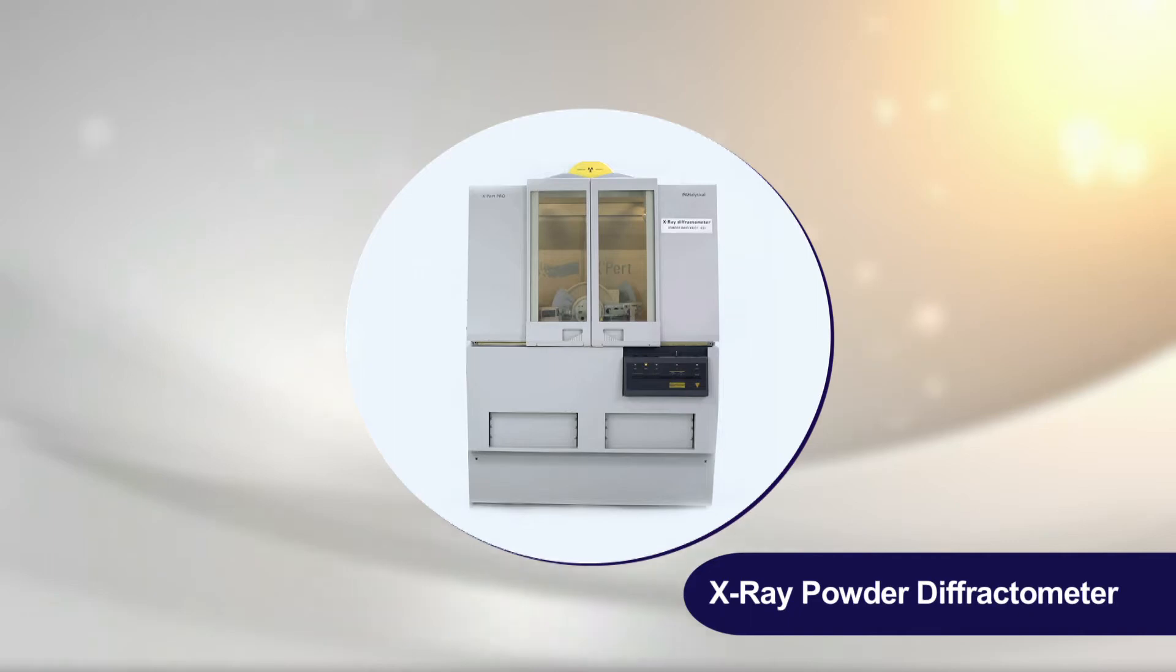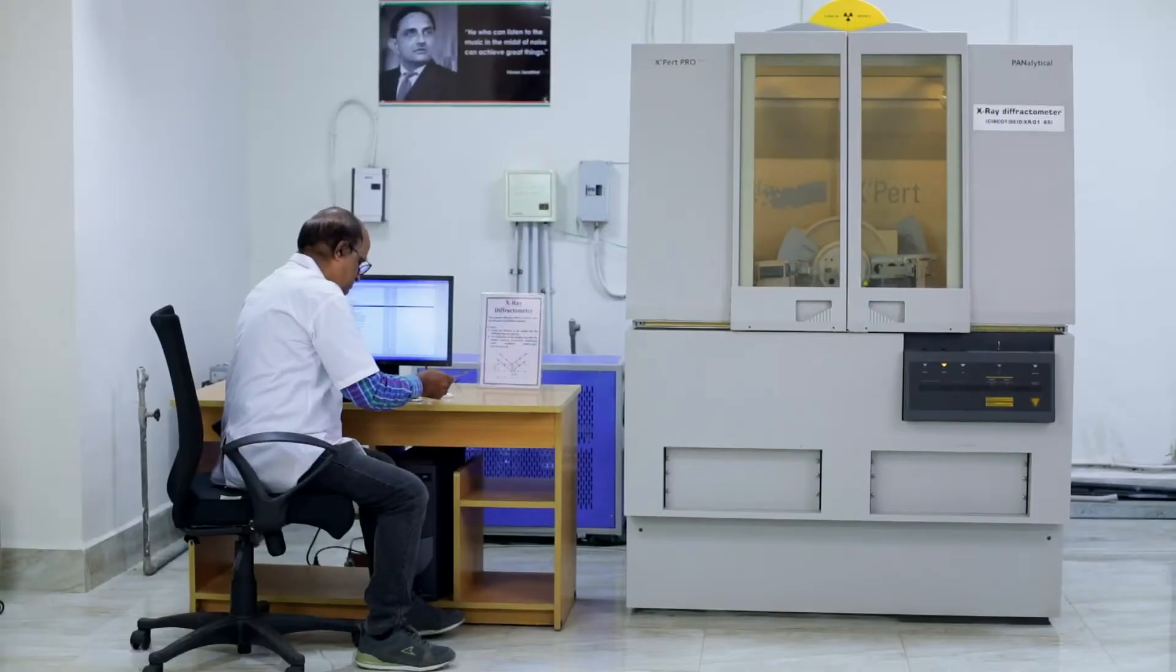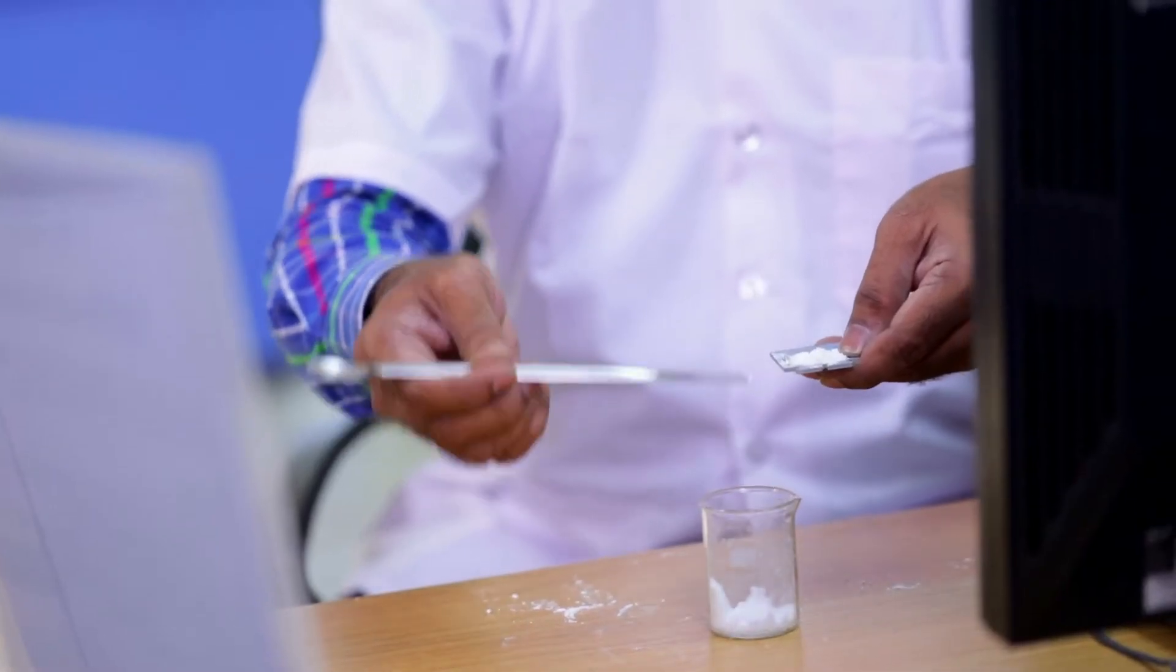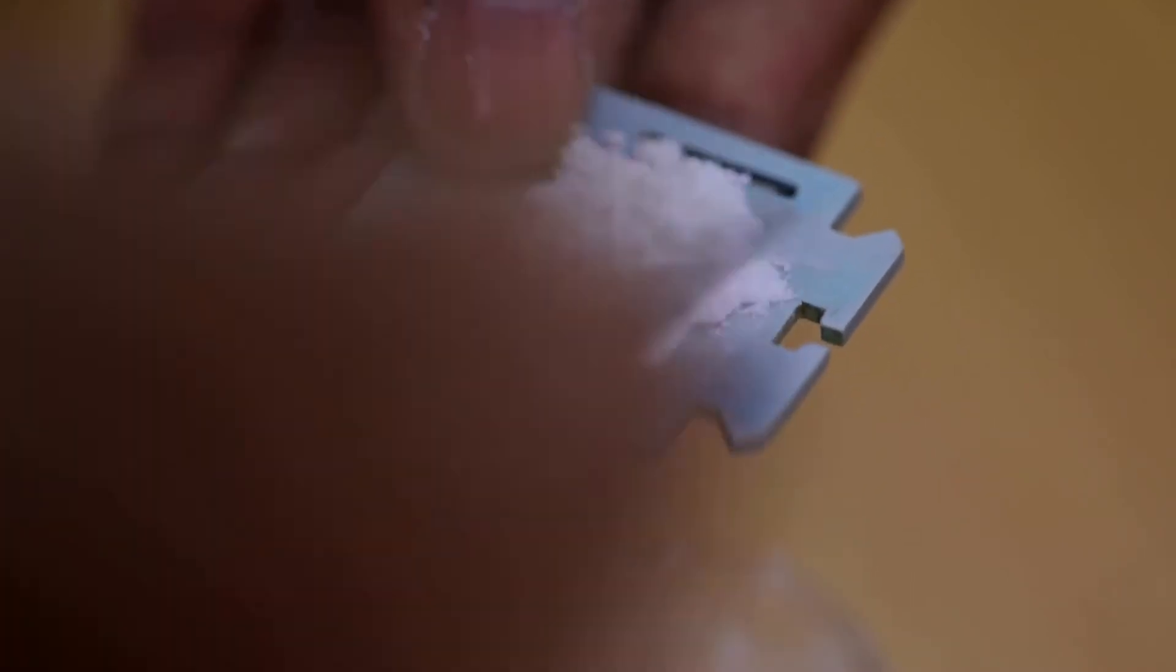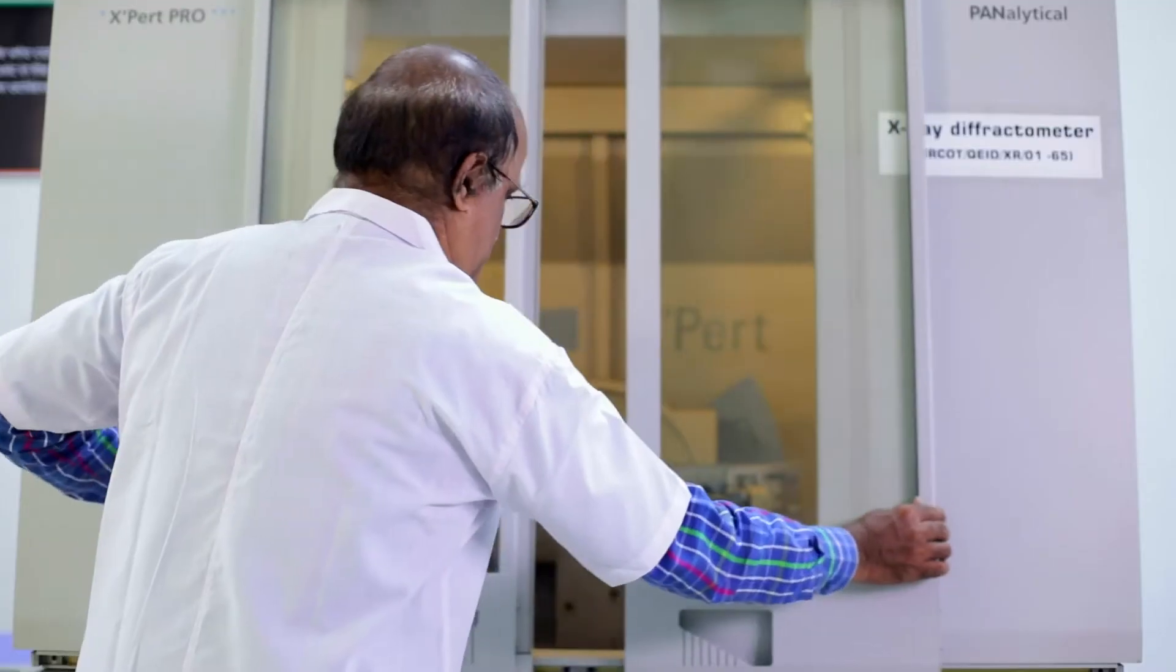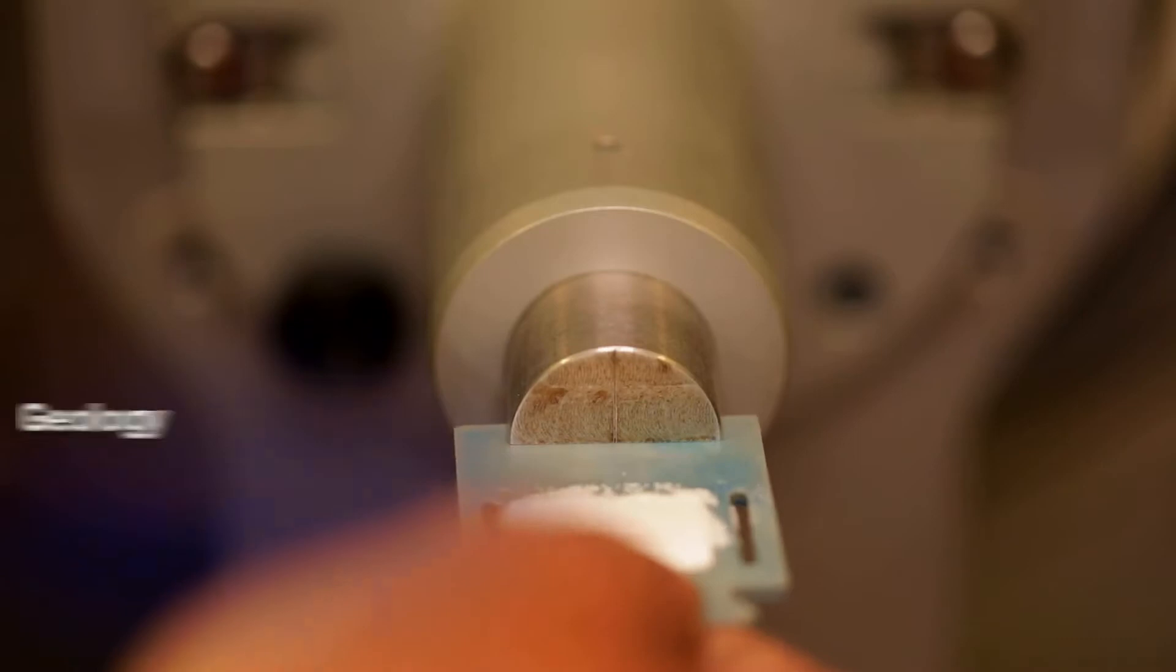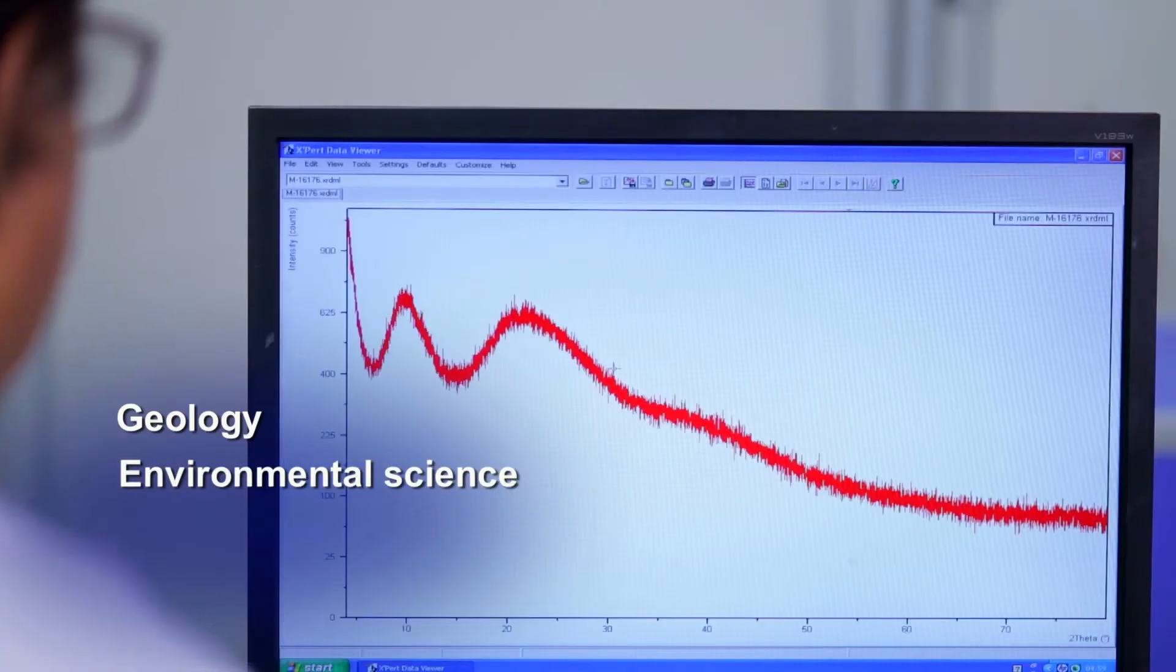X-ray powder diffraction is most widely used for the identification of unknown crystalline materials. Determination of unknown solids is critical to studies in geology, environmental science, material science, engineering and biology.